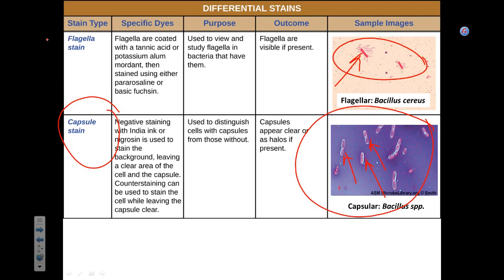Say you have a patient who's infected with Streptococcus pneumoniae. Fine, it's treatable. You take a sample, you run capsular stain, it's non-encapsulated. You can breathe. It's going to cause disease, but probably not going to kill the patient. If it's encapsulated, that's bad news. They have a really huge difference in virulence. So encapsulated Streptococcus pneumoniae is extremely virulent and very deadly.